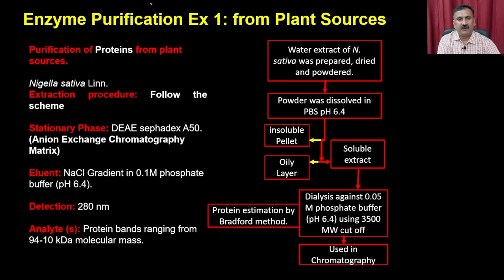Now the question comes, how can you use these different chromatography techniques for purifying proteins or enzymes? We have taken a couple of examples to explain how you can utilize these different chromatography techniques for the purification of enzymes. The first example is enzyme purification from plant sources.